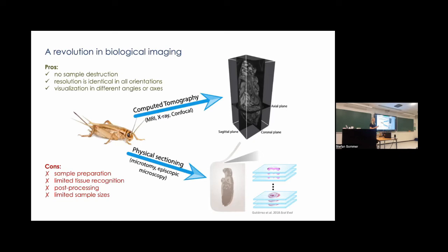But if you had something like a fossil, you'd grind a layer, take an image, grind a layer, take an image, or maybe you'd put these things in between glass slides. Tissue recognition: for X-rays to work, they have to be attenuated, and soft tissue's not very good for that. I'll get back to that.